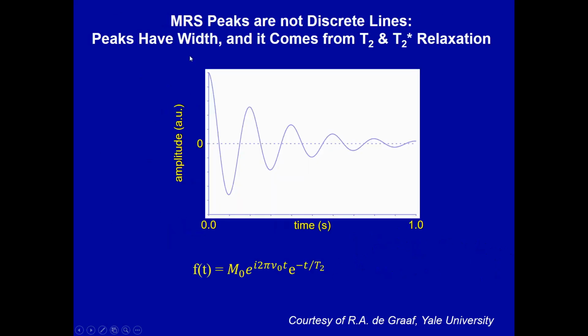Now, the frequencies that I showed you before in the transforms were spikes. There were straight lines assigned at particular discrete frequencies. If you have seen NMR spectra, maybe through your work here or through a lab when you were in graduate school or college, you'll know that those peaks aren't actually single frequency spikes. They have a width. They have a shape.